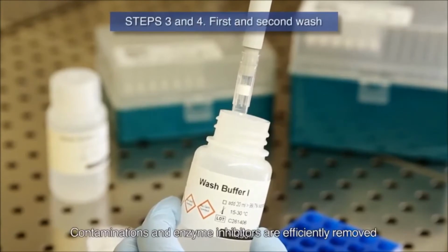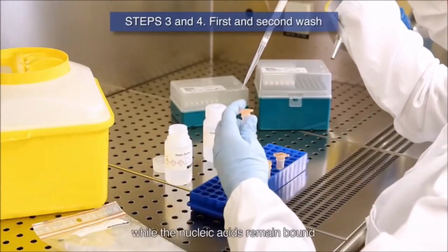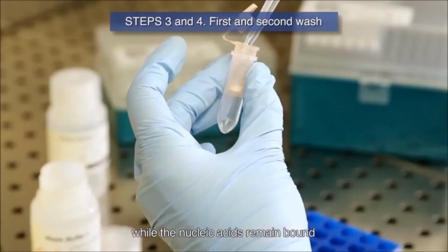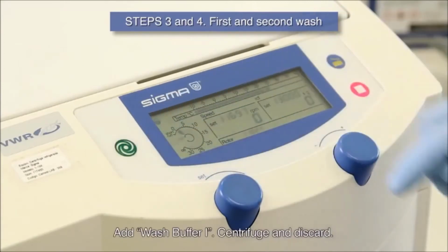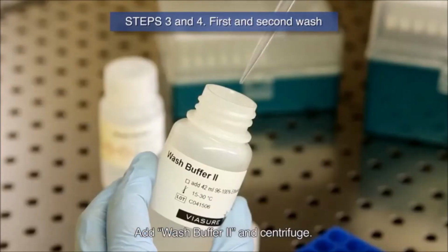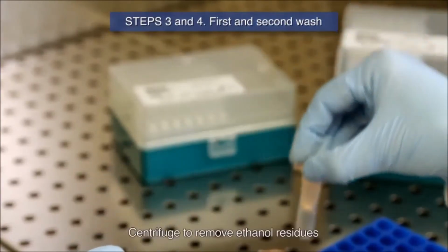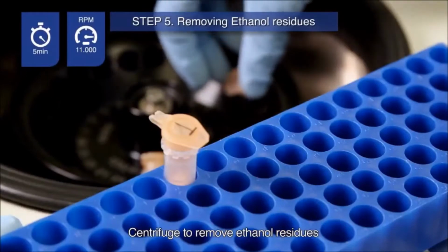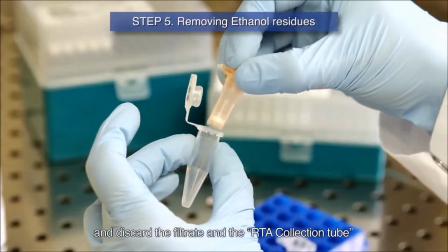Contaminations and enzyme inhibitors are efficiently removed during the following wash steps, while the nucleic acids remain bound to the membrane of the mini-spin column. Add wash buffer 1, centrifuge and discard. Add wash buffer 2 and centrifuge. Repeat this washing step once. Centrifuge to remove ethanol residues and discard the filtrate and the RTA collection tube.